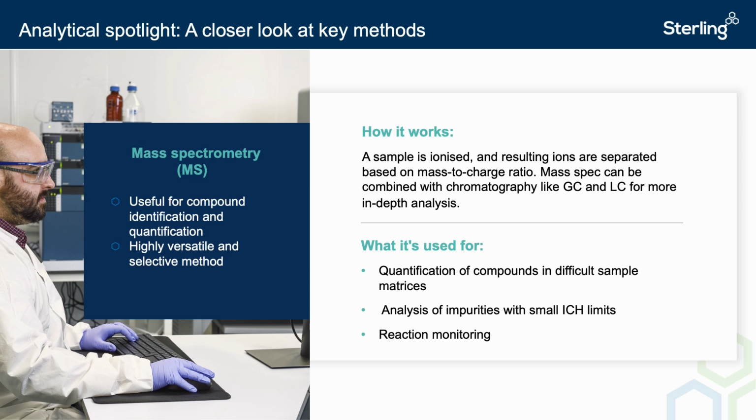LC-MS or GC-MS are exceptionally useful tools because they allow data to be generated that is both quantitative and qualitative. Traditional chromatographic methods only serve to quantify the purity or quantity of a known compound and do not provide much information about the compound's structure or identity. We can make reasonable guesses on the compound behavior in a chromatographic system, but mass spec allows us to definitively know what we're working with as well as its quantity.